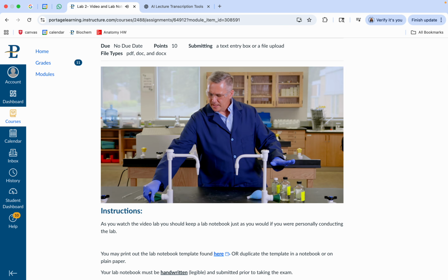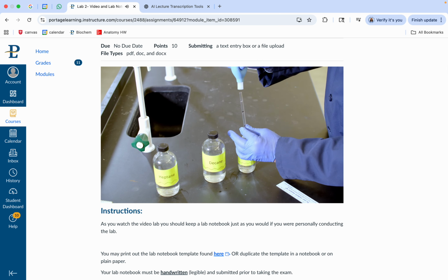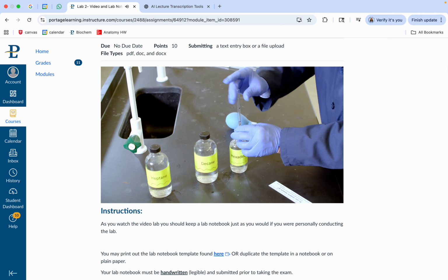All right, so we've done heptane and decane, so we'll do one final one, and this one is our hexadecane, so 16 carbons in a row with the appropriate number of hydrogens. These are all saturated compounds. If you've been paying attention with the heptane and the decane, you might make an educated guess about how this one is going to go. So you might make some observations. So this one is in position, so start, stop.